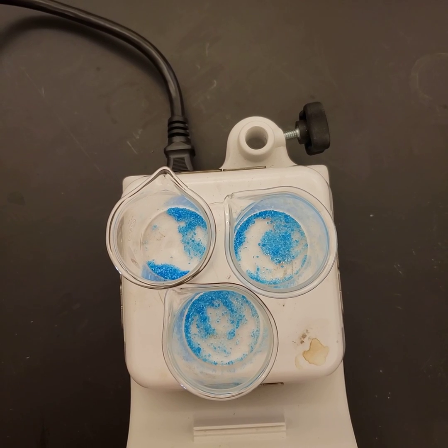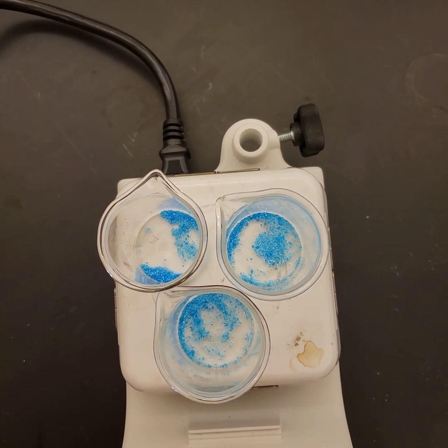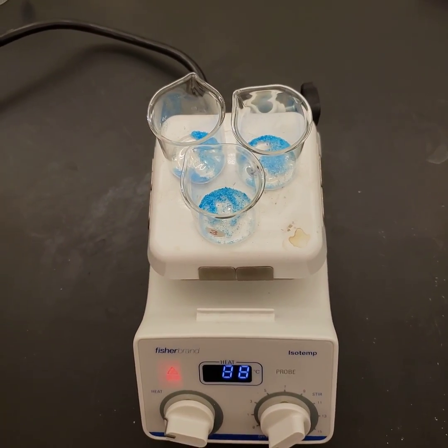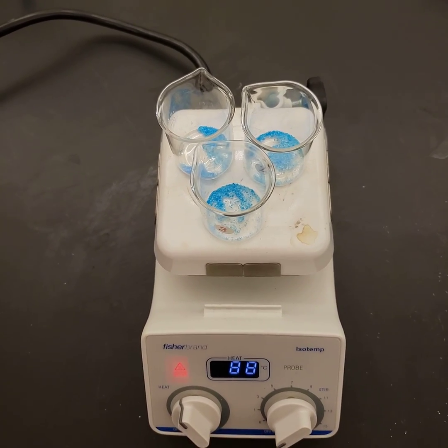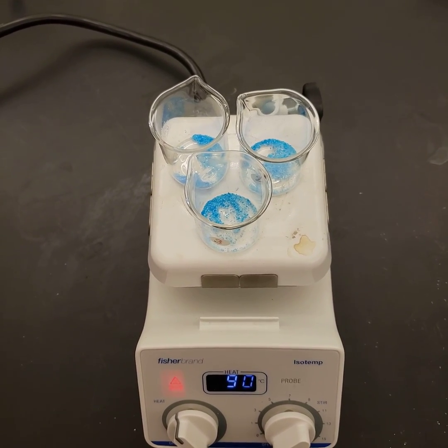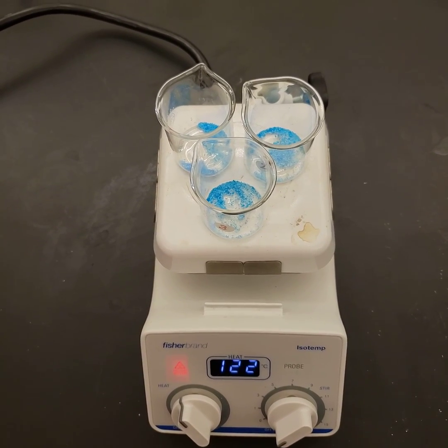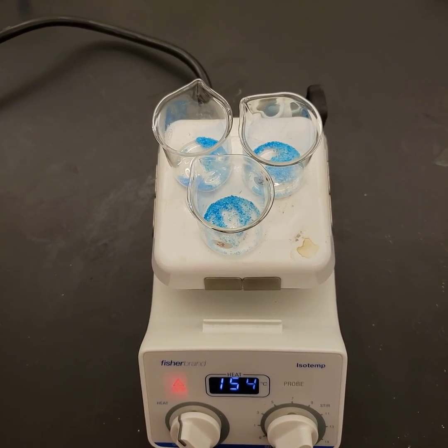We've massed these individual beakers, put the material in, and massed them again — you've got photos of each of those. Now we've put them on a hot plate to gently warm them. We need to crank it a bit because we're trying to boil off the water. This will turn into a lovely pale blue as the water disappears. I'll come back with that video in a few moments.